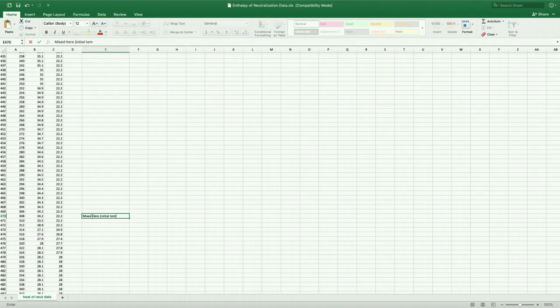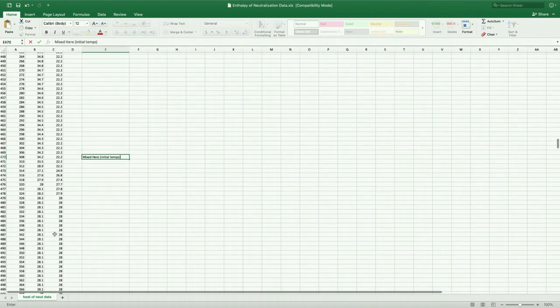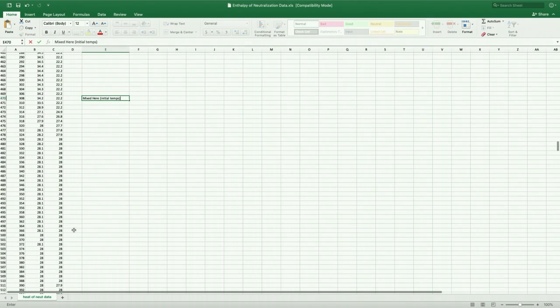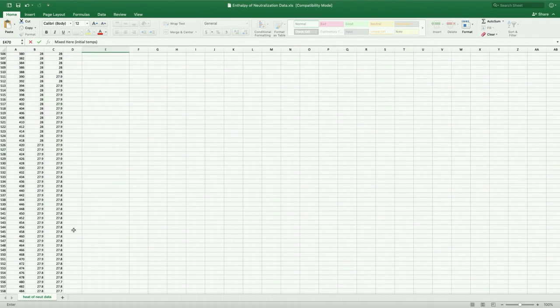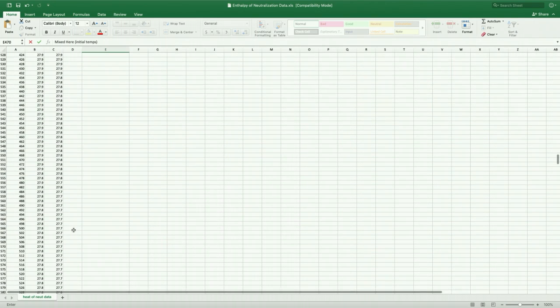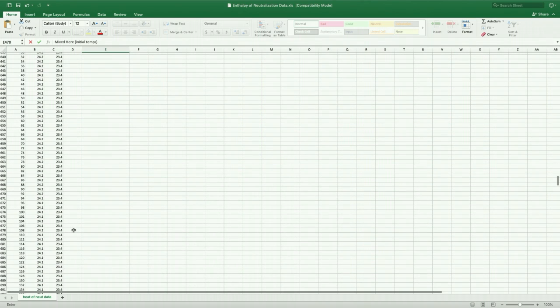Trial 2. And again, we see the two different temperatures. Looks like they come together around 28 or 28.1, pretty close together. You can probably use either one of those, it's going to be fine. CCPub is not programmed to take a specific value for these temperatures, so it's going to use whatever you give it to do the calculation. So you can choose what you think is best for each.